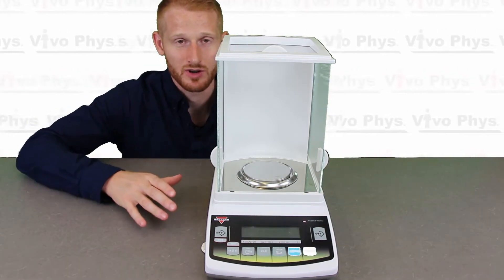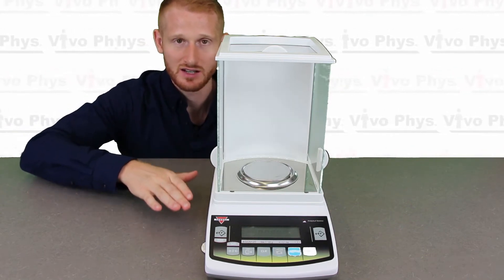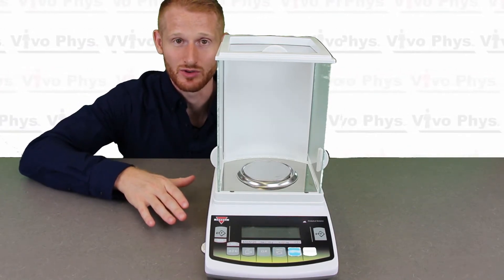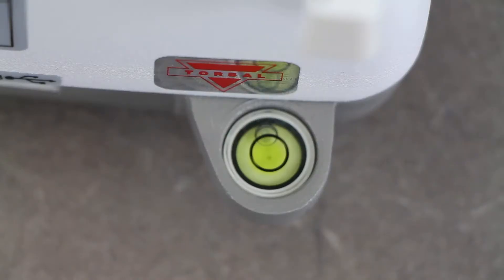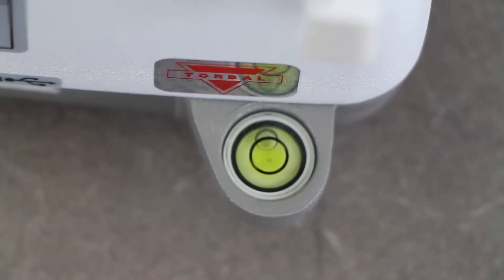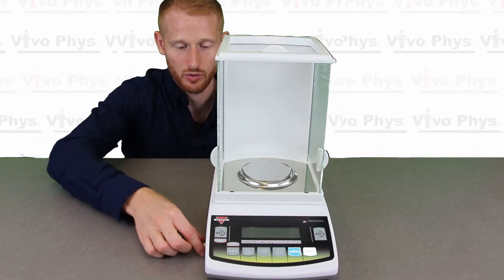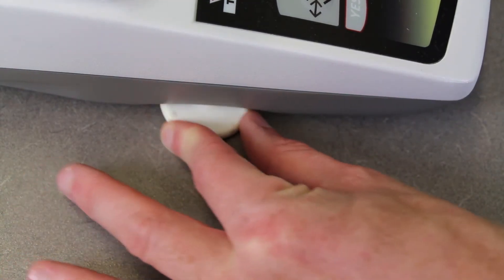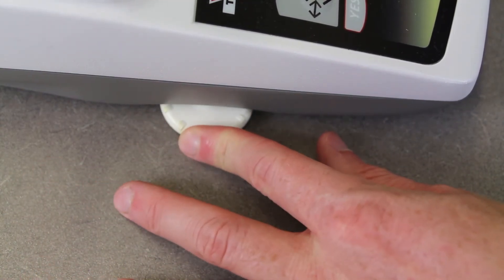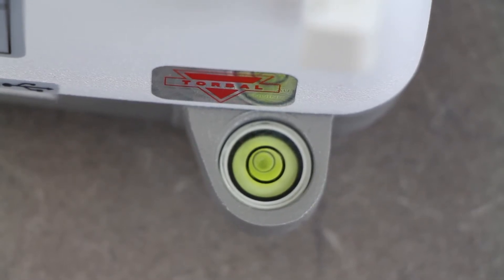The first thing you're going to want to do when setting up one of these scales, once it's all put together, is to get it on the table and make sure that it's level. You need to be leveled both forward and backwards and side to side. You're going to level it by looking at the bubble level on the back and these little white dials on the front where you can adjust how tall different parts of the scale's legs are — that's how you adjust it to make sure it's level.